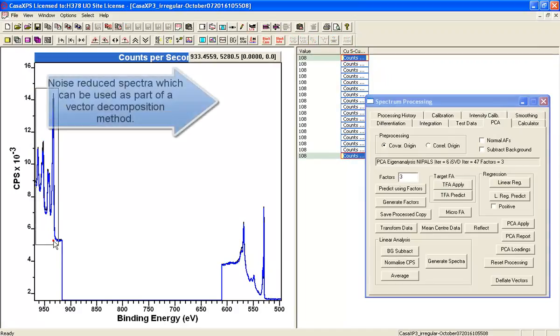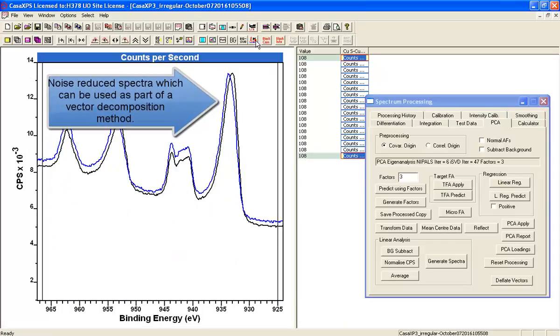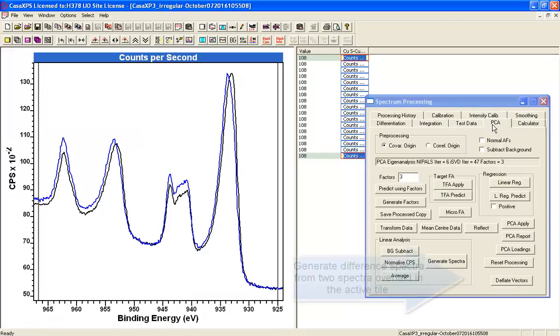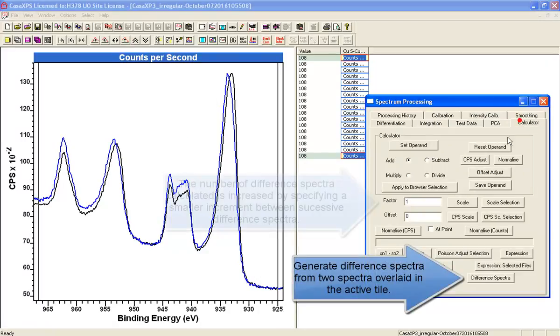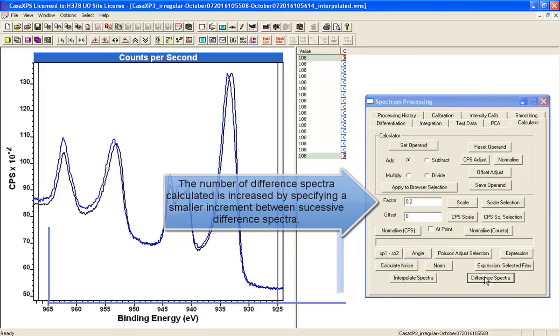And we can use this noise reduced set of data using the vector technique to work out different spectra and therefore work out component shapes that underlie this sequence of measurements.